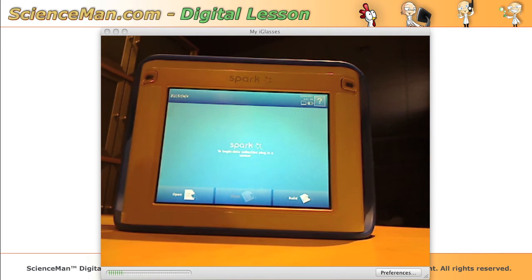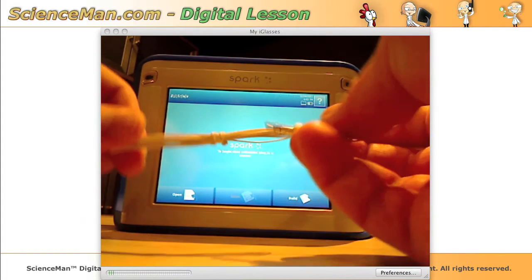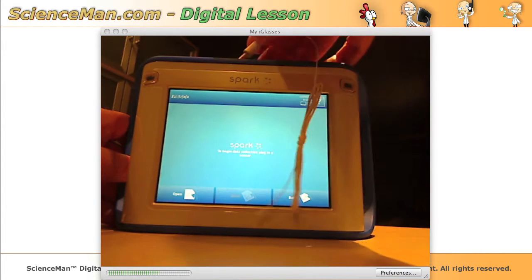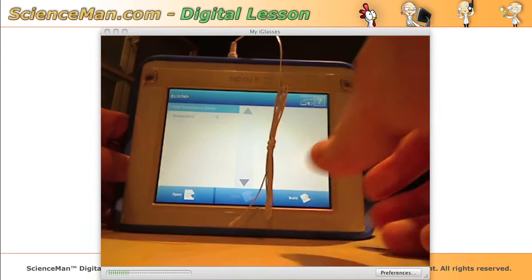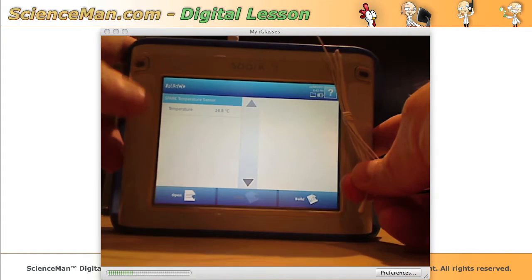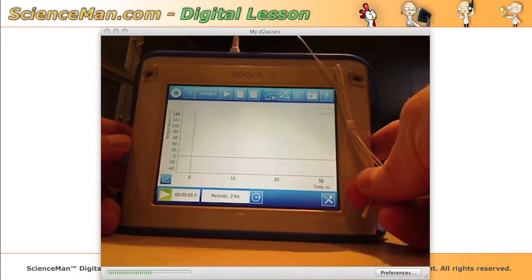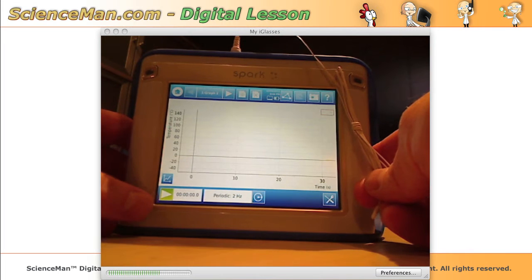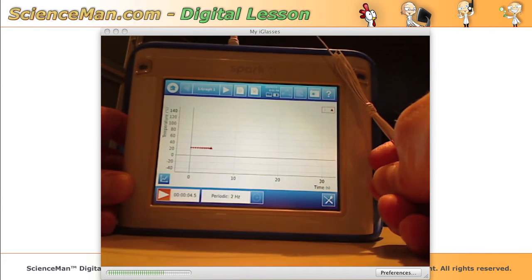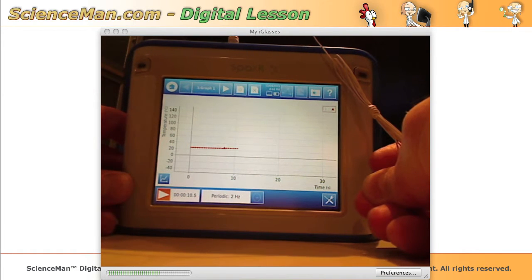What I like to do with these interface systems is give them the intuitiveness test and see how long it takes us to do our first experiment. So I'll just plug in the temperature probe, and you can see right off the bat we have temperature come up on the screen. I'll select that, click show, and then press the green start collection button — and there we are, we're collecting data. I'm just going to hold the end of the temperature probe to make our data a little bit more interesting.